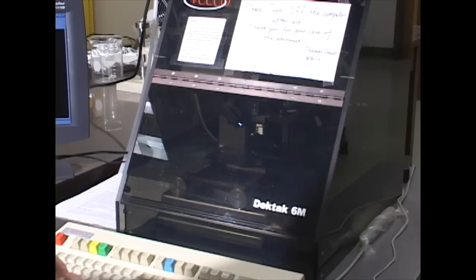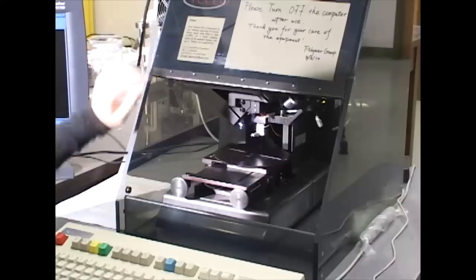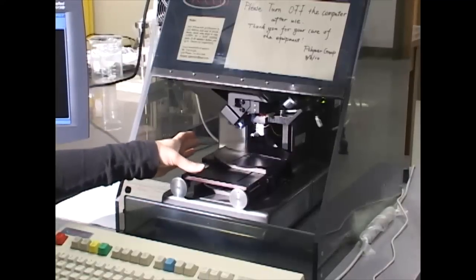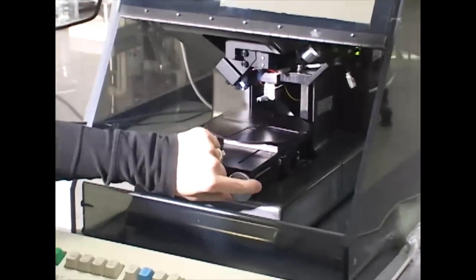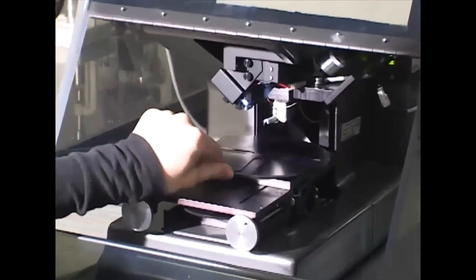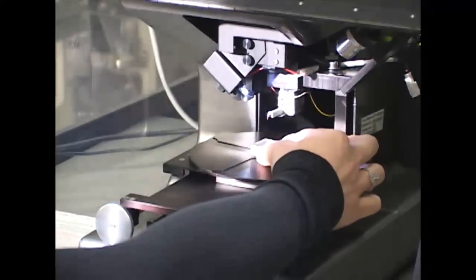So the next step is to load our sample. We'll open the chamber. Inside we have the rotating sample stage. It's adjustable with a few of these knobs here, and then also it turns. So we'll place our sample.